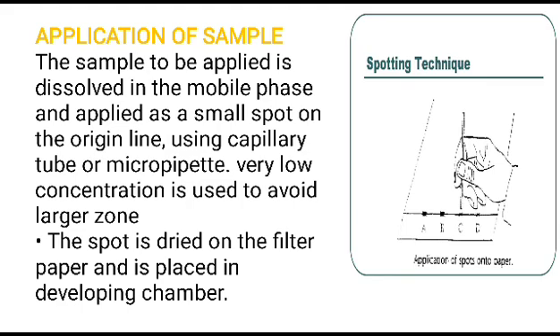So now, how to apply the sample. Application of the sample: the sample to be applied is dissolved in the mobile phase and applied as a small spot on the starting line using a capillary tube.